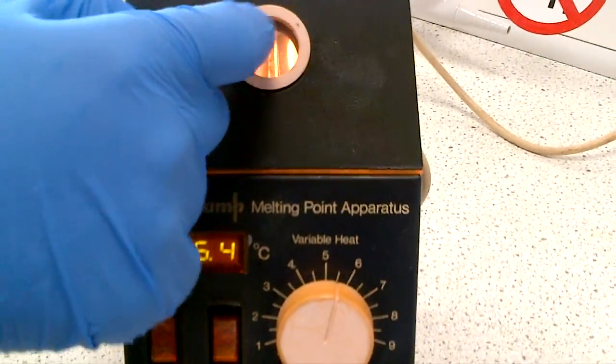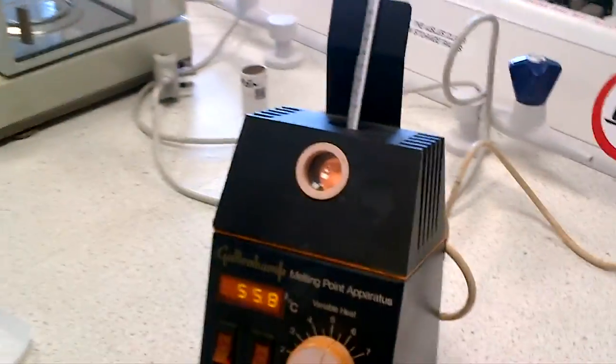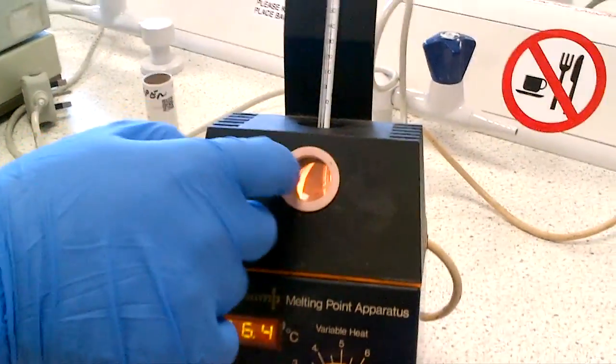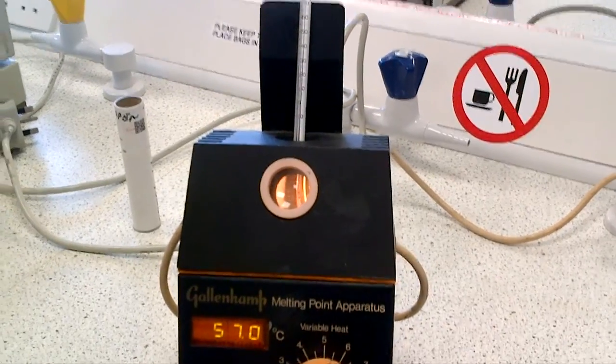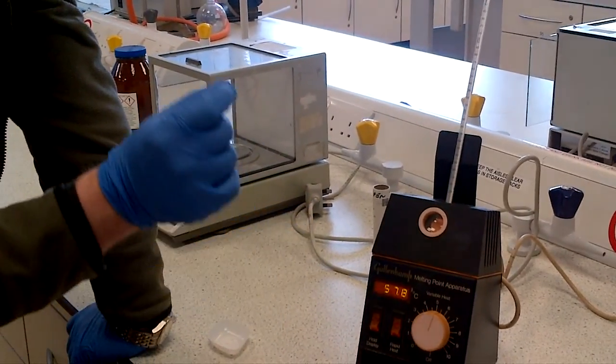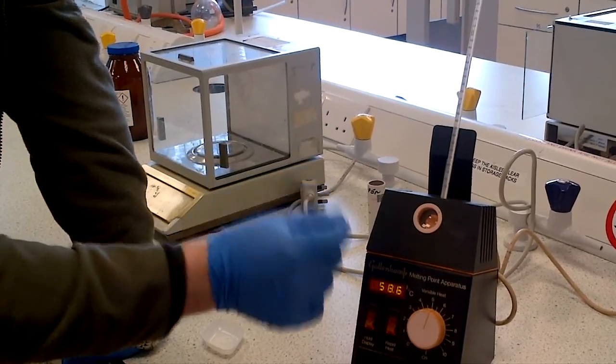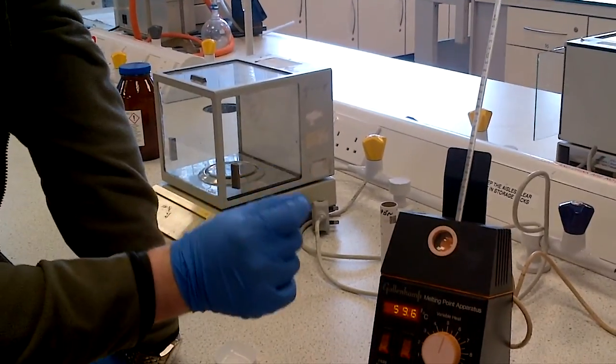So you always look, and I'm just going to peer into view, you always keep looking at the sample. Don't walk away, don't go and chat to your friends, don't go for a cigarette break, don't go to a trip to the toilet, keep looking. And you need to look for the first sign of melting, so that's when the first crystal starts to go gloopy, that's the start of the melting point range, and the melting point range finishes when the last crystal goes into that liquor in the capillary tube.